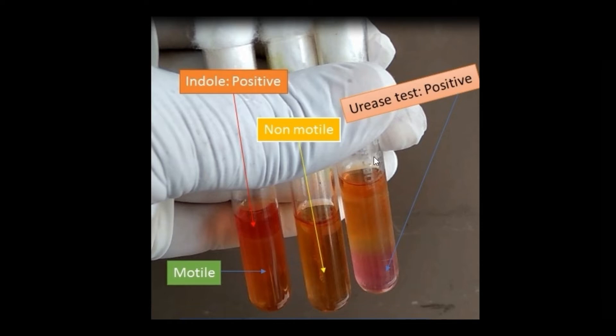Here you can see this is the MIU medium or MIU agar. The test organism was inoculated. After overnight incubation, we have this type of result. Now let's try to interpret the test result.